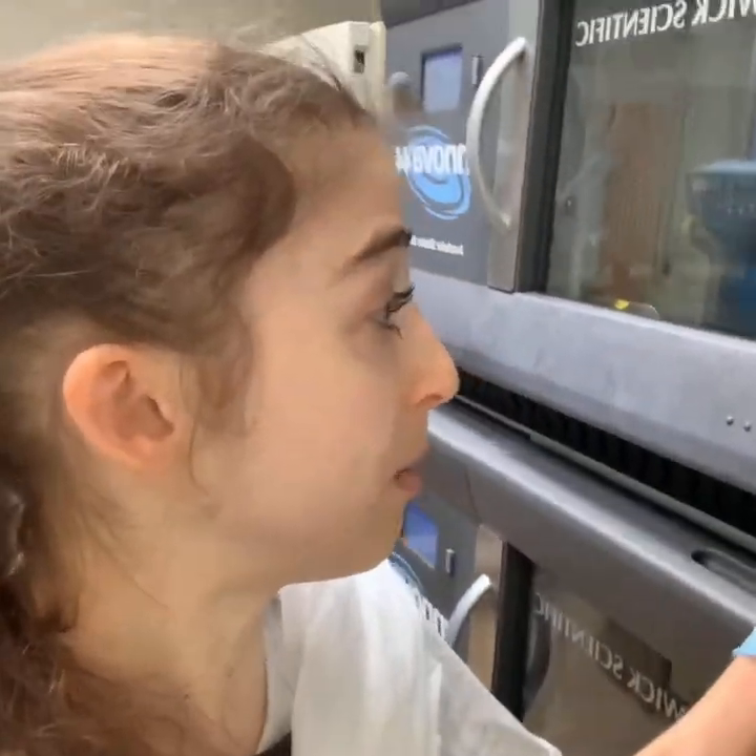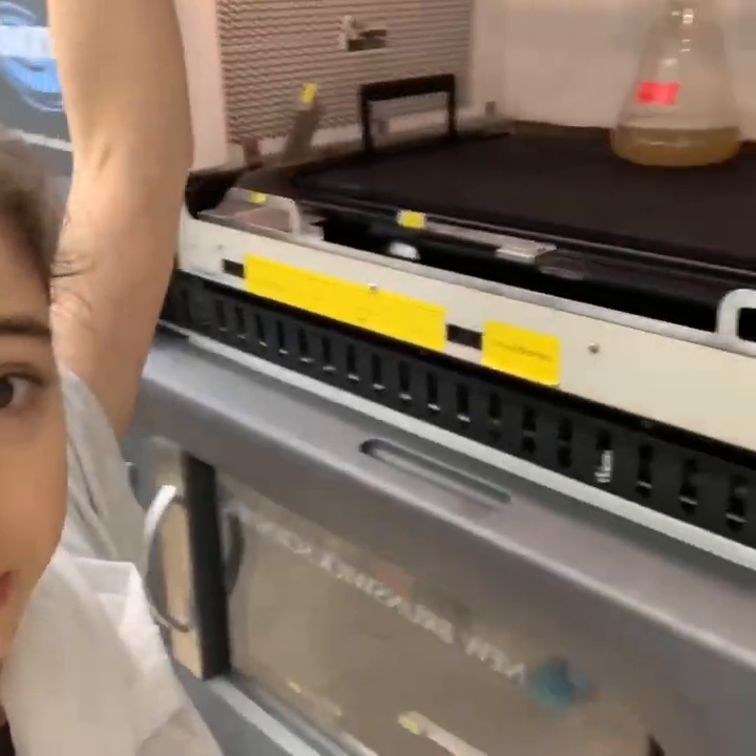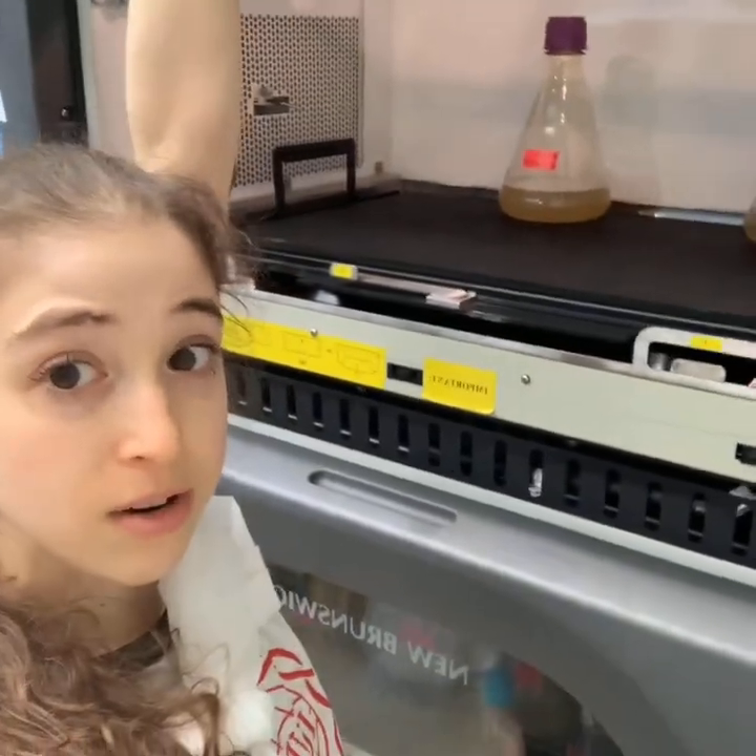Normally we have liters and liters of cells growing, but we don't have that many right now because there's a crazy media shortage backordered until August. We grow them in these one-liter flasks, and we can grow lots of cells.